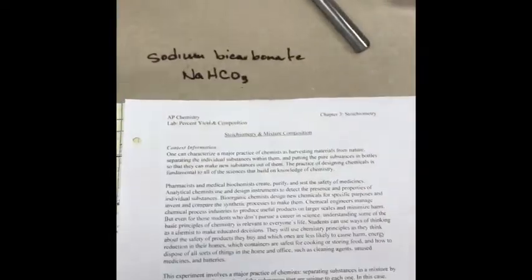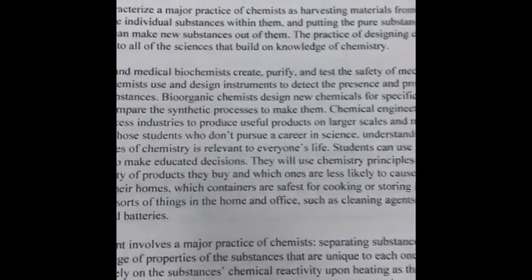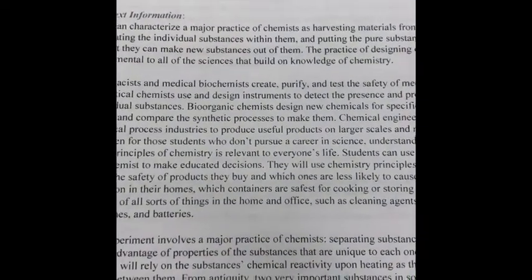Hey everyone, so here we are. Our lab today is on stoichiometry and mixture composition.